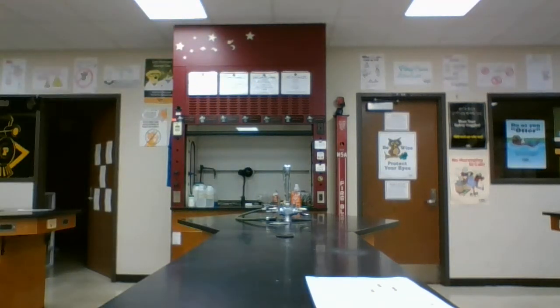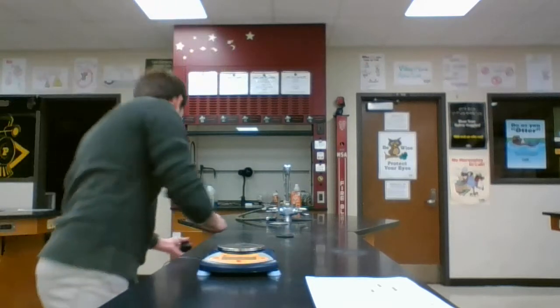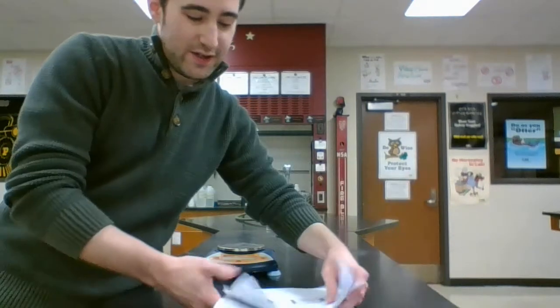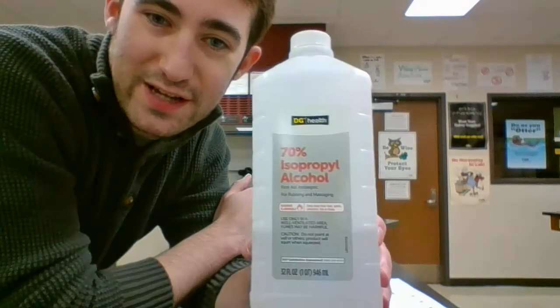So that's the first station. Next up, speaking of density, I'm going to be looking at 70% rubbing alcohol, also known as 70% isopropyl alcohol.